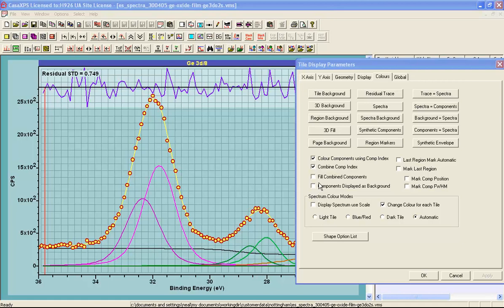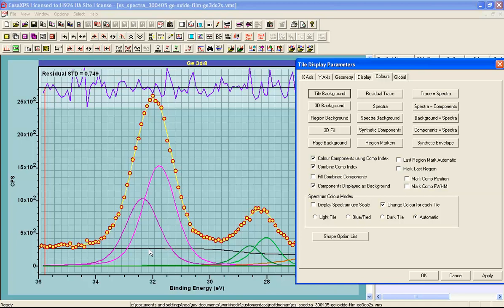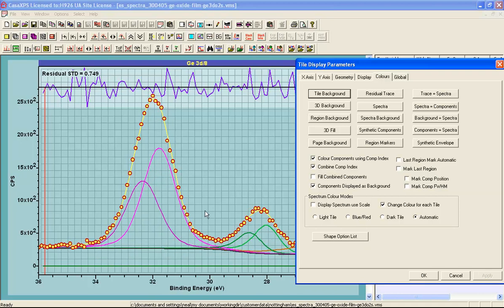This can be achieved if the background signal is assigned a component index of minus one. And then when this button is ticked here, that indicates that components should be displayed as if they are a background. In other words, any components that are not background signal will sit on top of the components that are background signal. Then when I press apply, the components now sit on top of this Shirley shape that is formed from components.